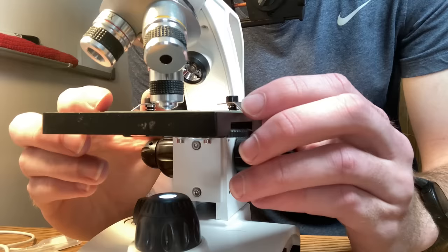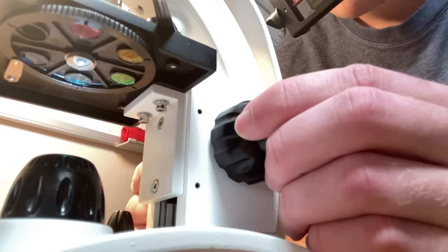This is healthy human blood. You can make out the round, red shapes of blood cells, and there isn't too much coagulation going on. They're still moving fairly freely in the slide. Now, have a look at the venom sample, and let me know in the comments below what you notice is different. My first observation is they're not red anymore.